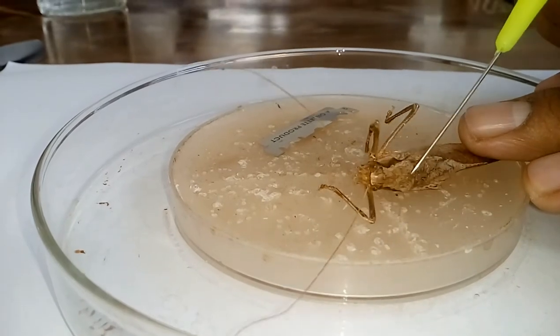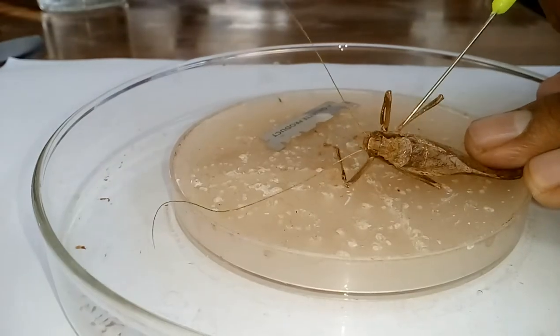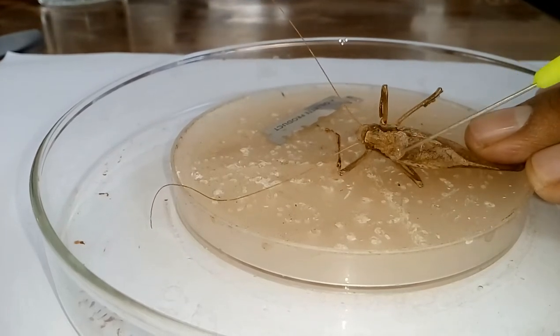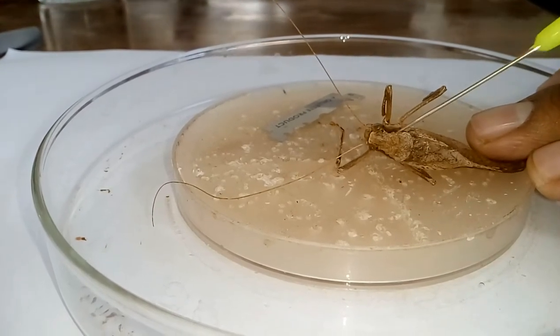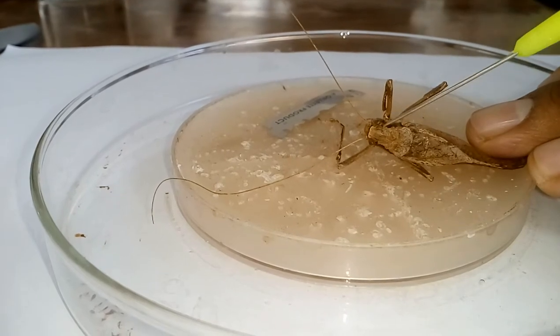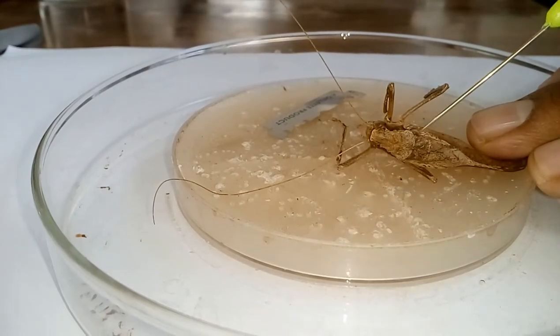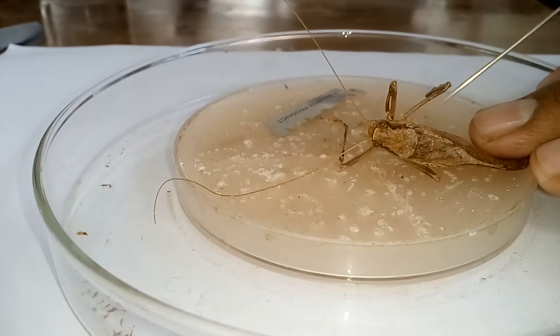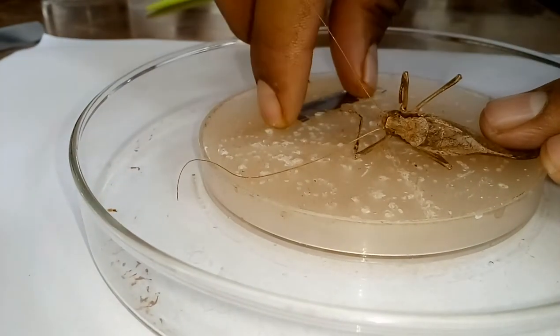This area from here to here is known as the pronotum. Using the blade, we have to just slightly incise from there. If we cut this area — because it is hard — we have to control our hand and not insert the blade into the body of the insect too deep.